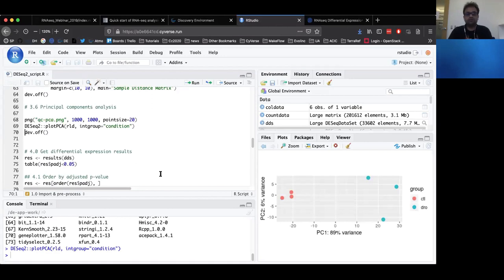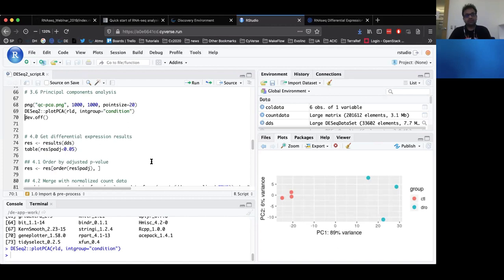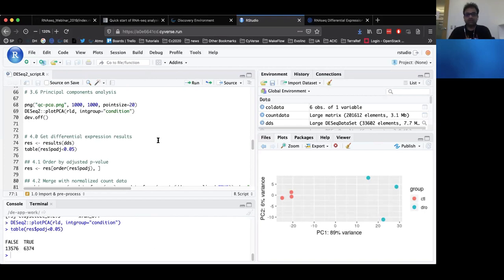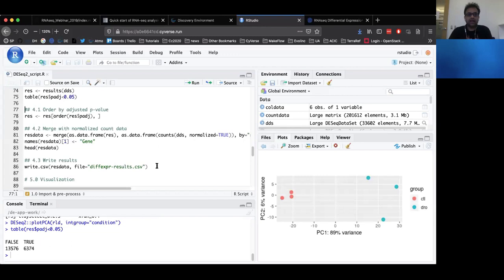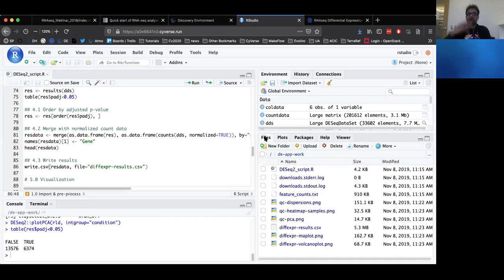Once you have performed the quality control section, the next step is to get to the differential expression results, where depending on the p-value significance you're looking for, you can find out how many genes are differentially expressed between the condition of interest versus the control condition. We also have a section in the script where we write the differential expression results to a CSV file that can be used for further explorations such as gene ontology analysis, depending on whichever direction your research takes you.